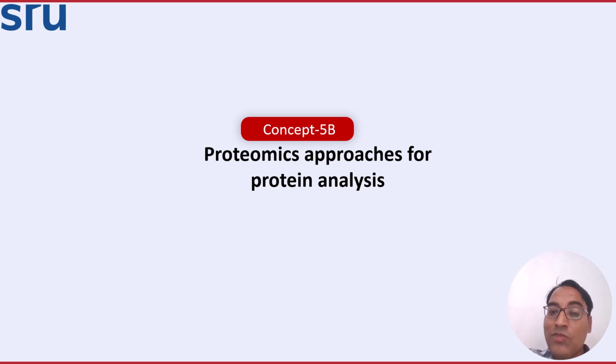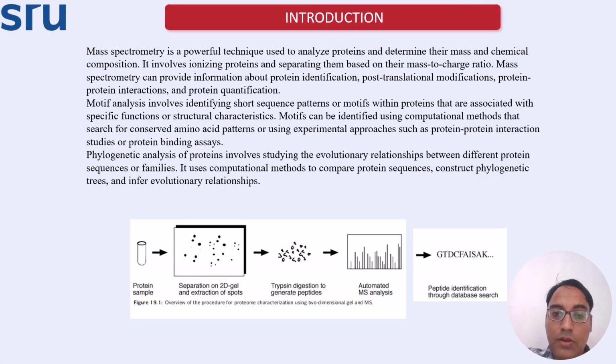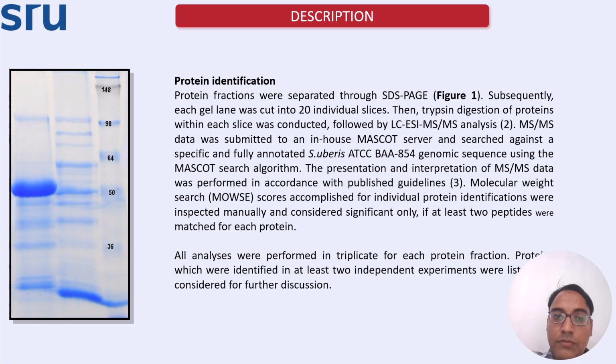Now we are going to the second phase of this session. Now we are extending it further, see. We are doing exactly like using SDS-PAGE, see. Then we have taken it from a research paper, see the trypsin digestion you are doing. You are doing the mass spectroscopy, MS data is sent to the Mascot server. You get the data, see, that it belongs to this.